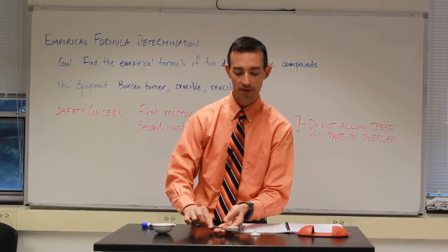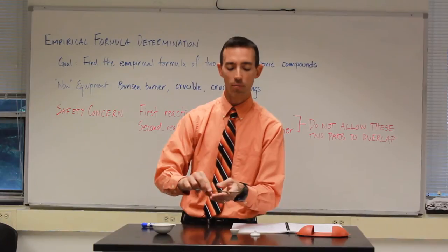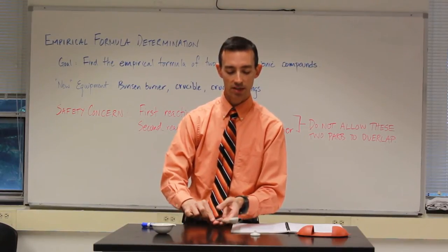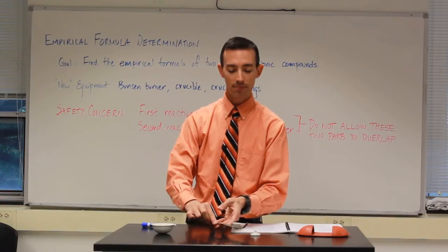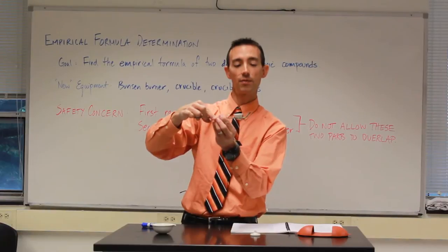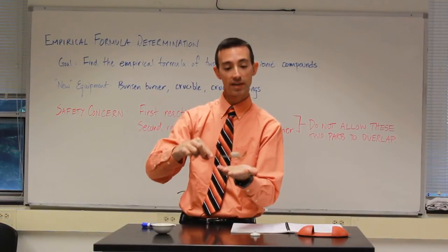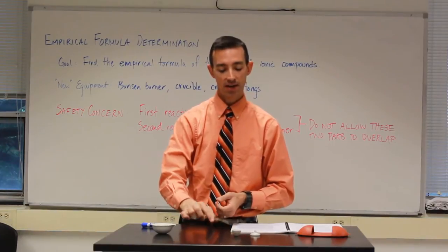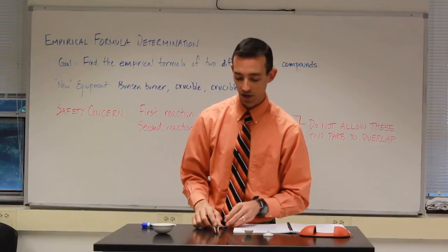This requires a couple of hands. And now you're resting the crucible in that opening of the tongs. The jeopardy of doing this, though, is if you squeeze too hard, you might pop the crucible up. Although most of ours are small enough that they stay, even with the tongs pinched completely shut, the crucible nests very nicely into that opening. So this is the crucible and the crucible tongs.